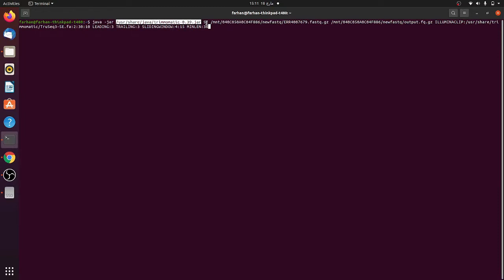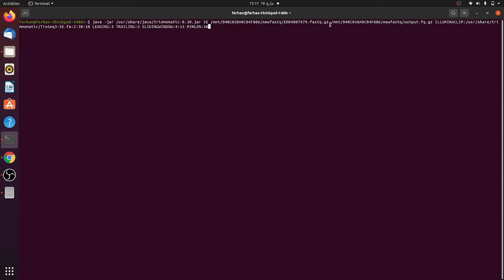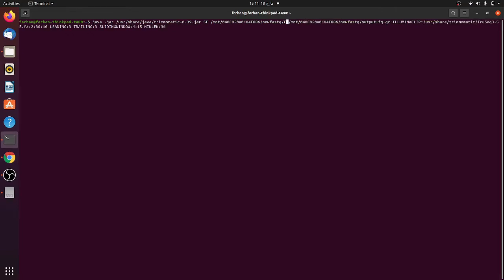After that you have to write the location where the file is saved. If you want to, just to show you that if you want to change the file, this is very straightforward. For example, just for you, if I just change it, there is a list of files, right?